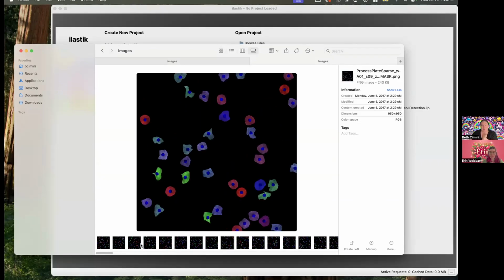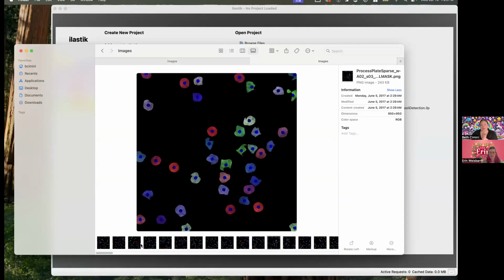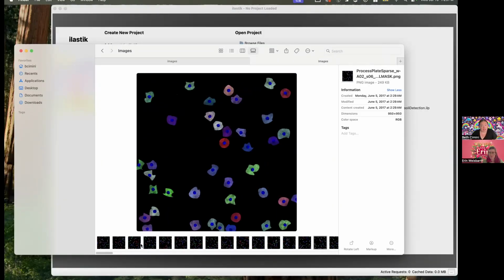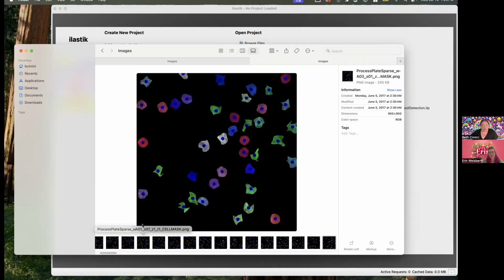The nuclei are always blue, but the authors here computationally made a bunch of cells with lots of different colors so that they could test how well classification algorithms worked to classify a cell as red, green, or blue. So I thought that was a cool data set. And you can imagine that, especially if I care about the difference between the nucleus and these cytoplasms, it might not be super easy to tell CellProfiler the difference between what parts of the image are cell and which parts are background, but maybe not the boundaries of individual cells because there are lots of different colors.